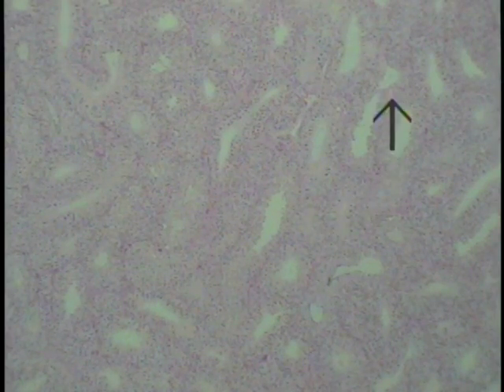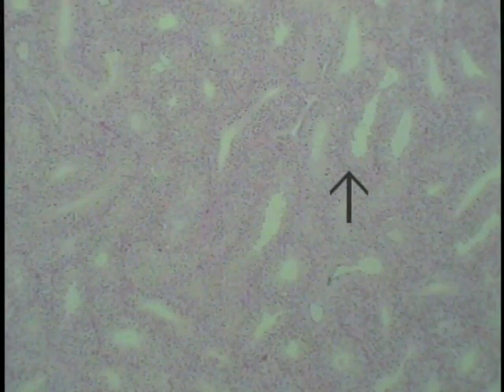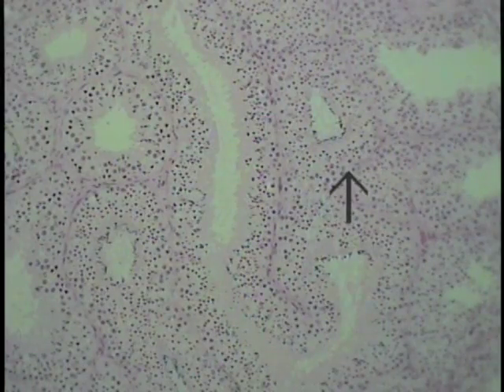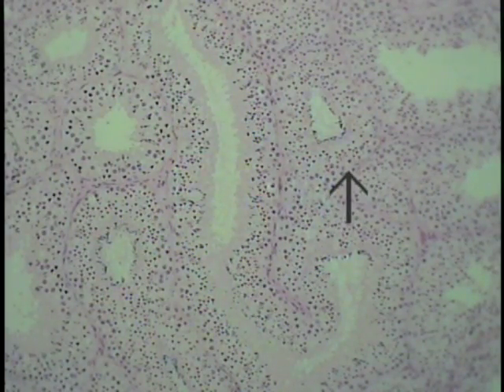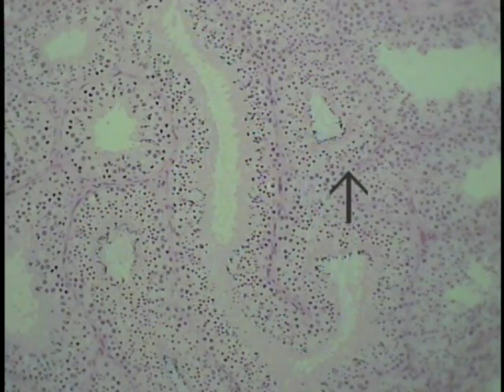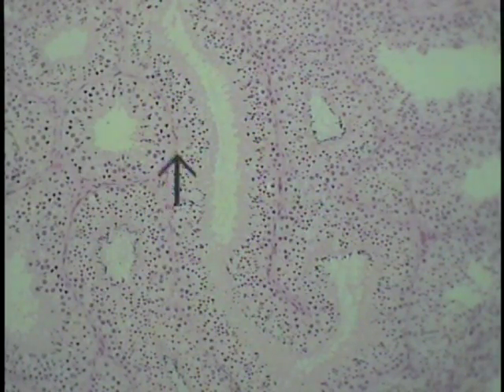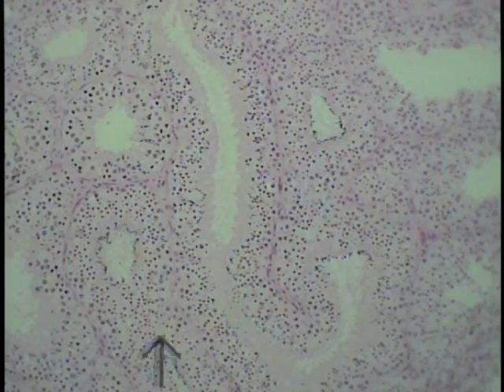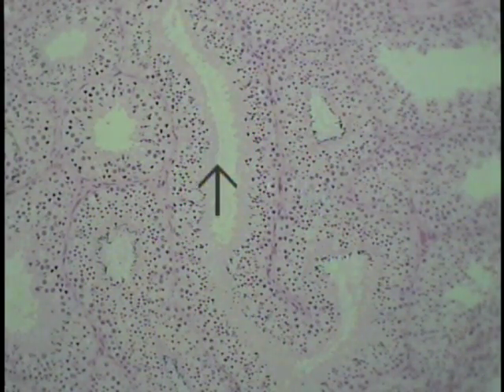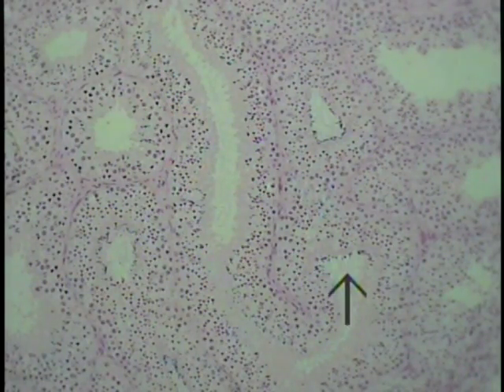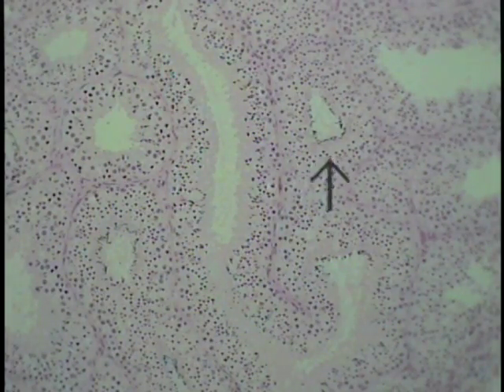Find and identify some of the seminiferous tubules and examine them at increased magnification for the various cell types. The same testis viewed at a slight increase in magnification shows the seminiferous tubules in greater detail. Some are cut in cross-section or transverse section, and another profile begins to meander toward the bottom of the field. The lumen of the seminiferous tubule is indicated by the arrow, curving back to the right.